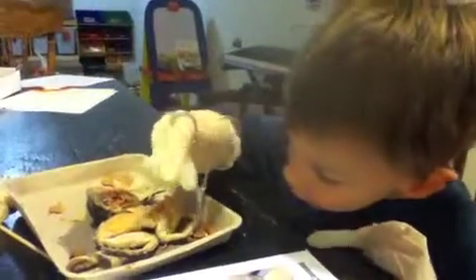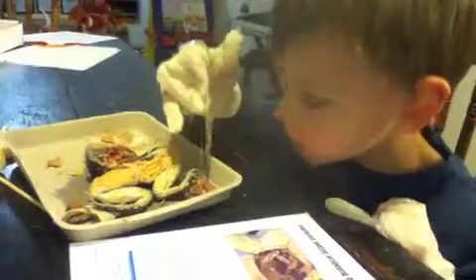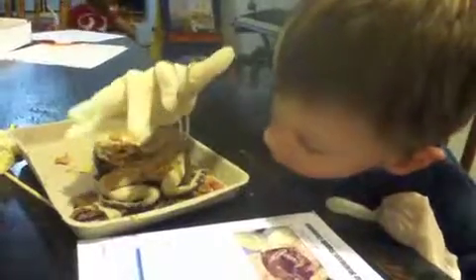Where are the intestines? Where'd they go? There they are. We cut open the legs so we could see the bone. Oh, now we're cutting the feet. Good job on those feet, Harry. We got to look at the tongue too. We opened up its mouth and saw the tongue.